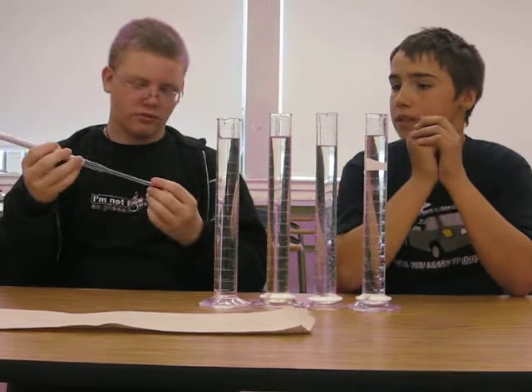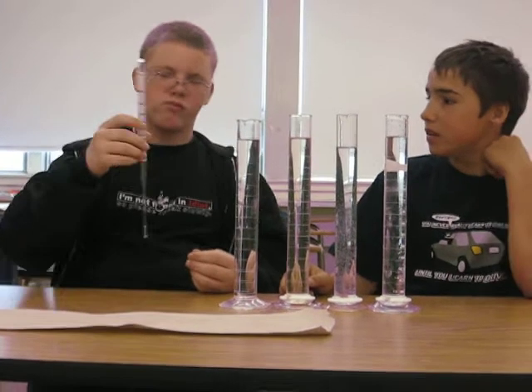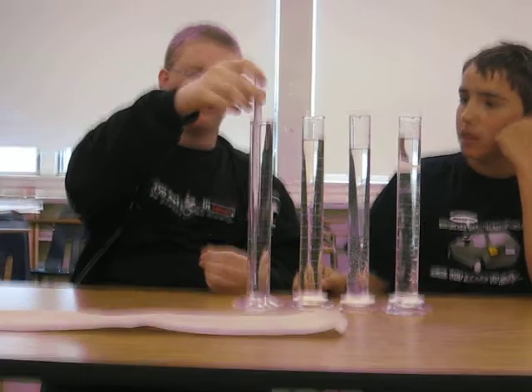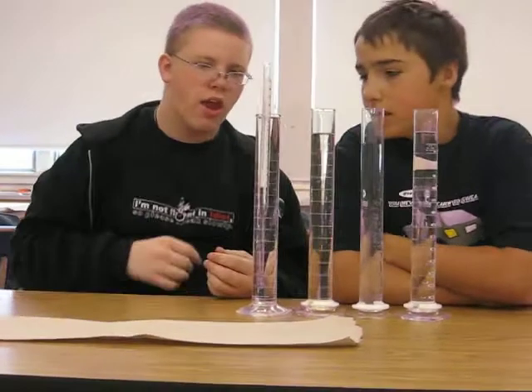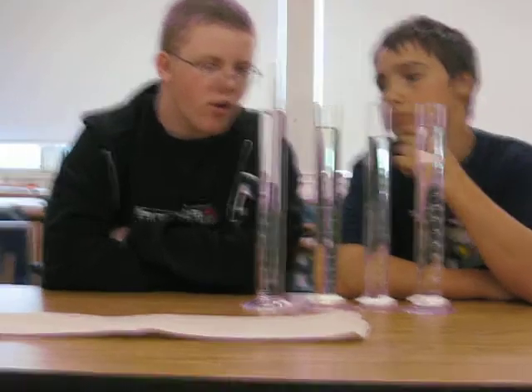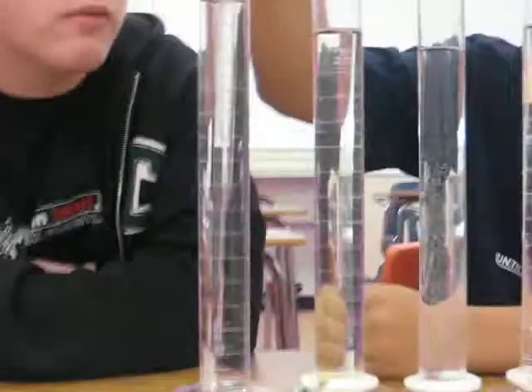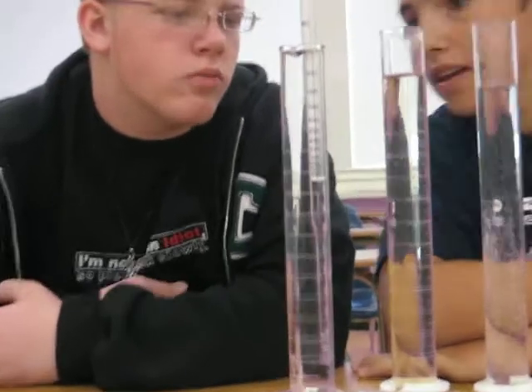So do you want to try something? Let's see what rubbing alcohol's density is. Let's drop it in here. As we taught you about the meniscus, you're going to have to watch and look at the meniscus, and then see what it reads.